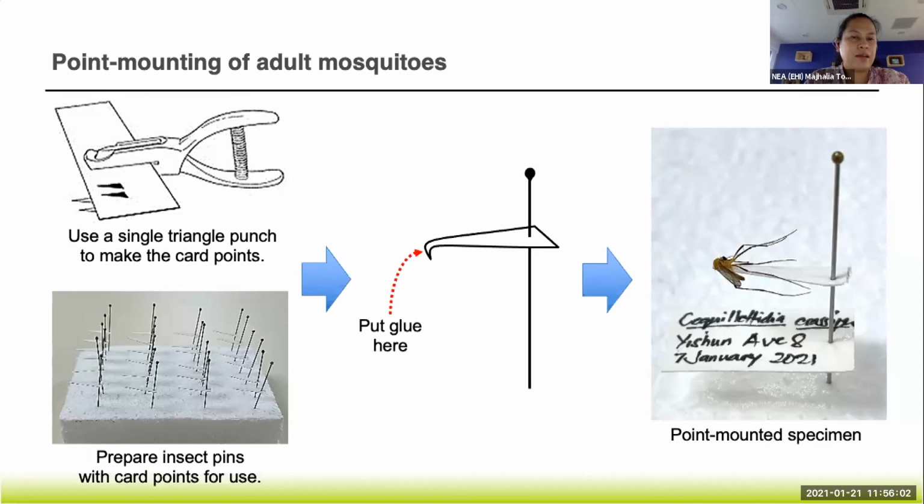Nail polish remover, just be careful, because some chemicals will cause your mosquito to drop their legs. And at one point when I was doing this earlier, there were suggestions to use cigarette smoke. So I tried it and all the legs dropped off. So just see if it will cause damage to your sample; if it does, don't use it.